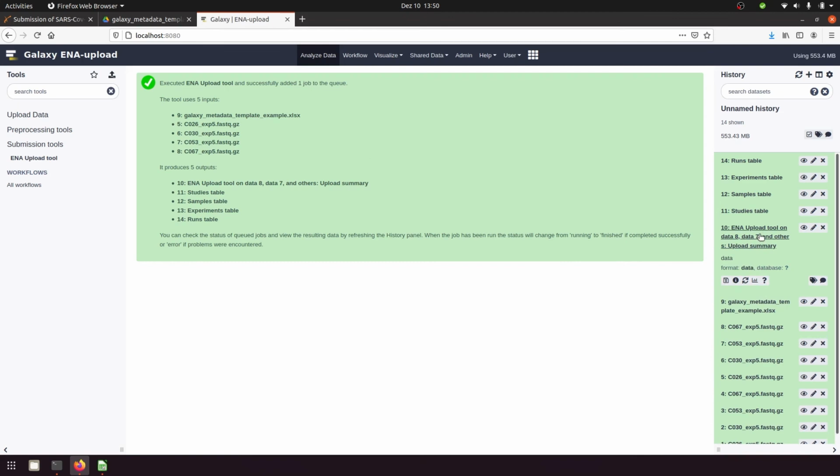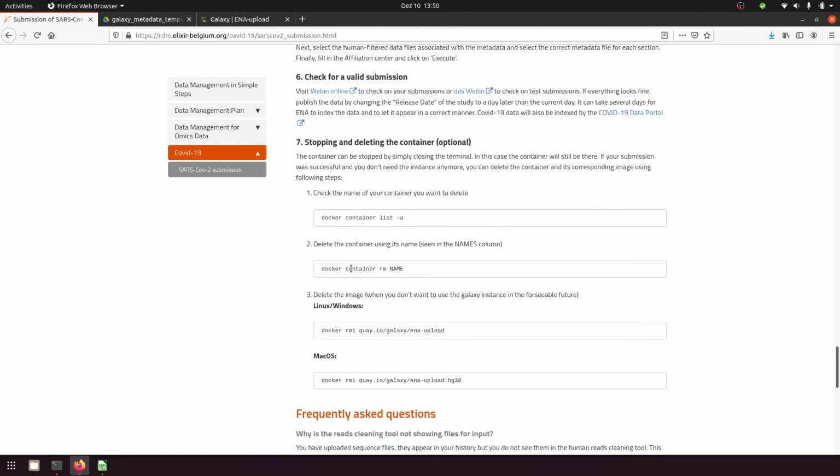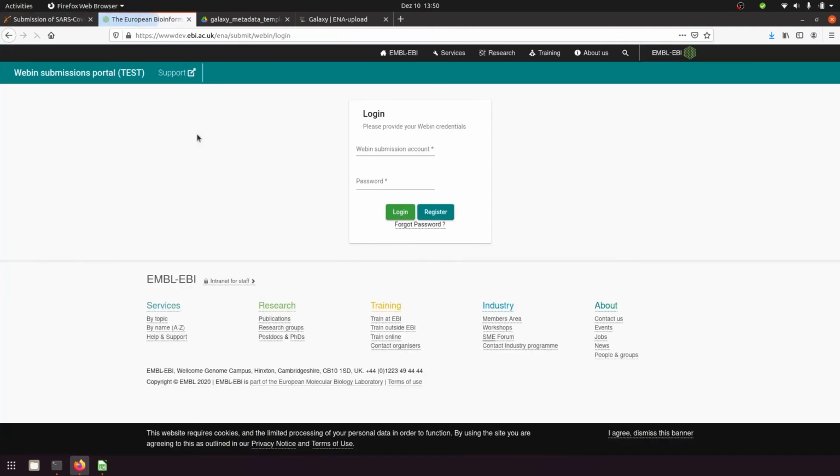Now we check on our submission on the website of ENA itself. The correct link to the Webin for both the dev instance and the public instance of ENA can be found in the documentation and in the links below this video. Fill in your Webin ID and password and click Login.